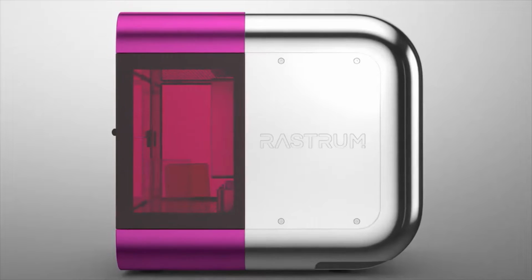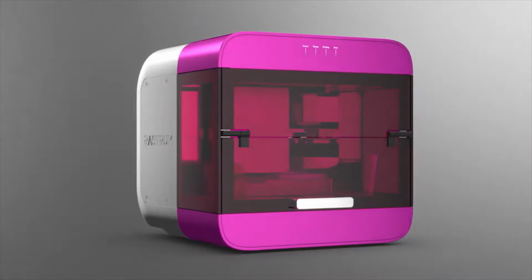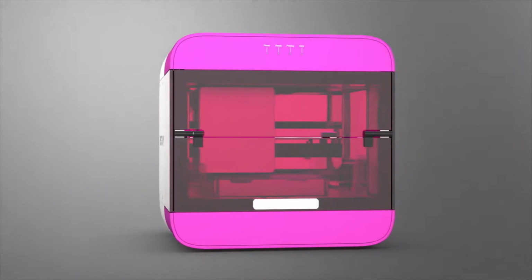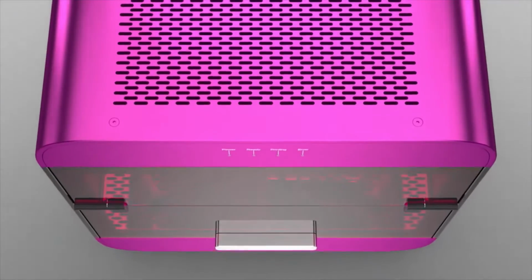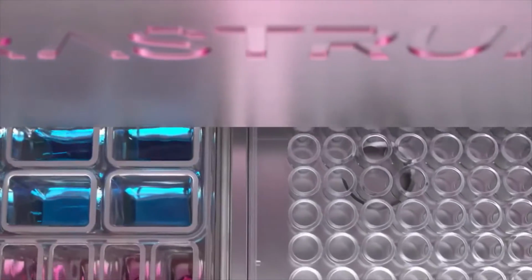Introducing RASTRUM, the revolutionary 3D cell biology platform from Inventia Life Science. With advanced digital bioprinting technology, creating 3D cell models has never been easier. Printing commences once the kit and multi-well plate are inserted.